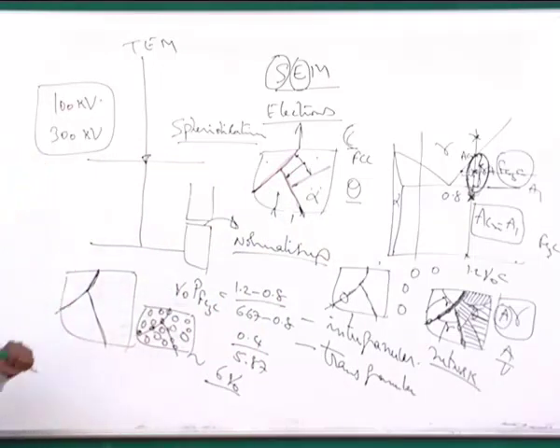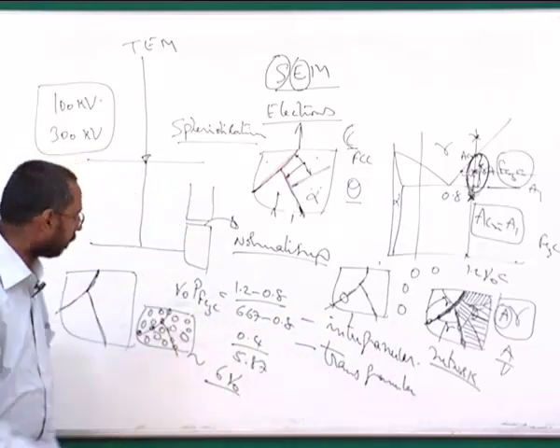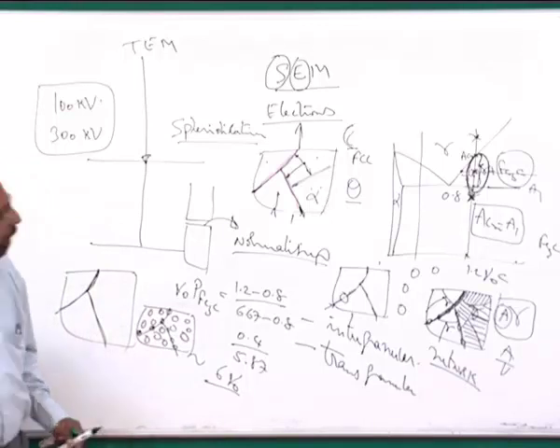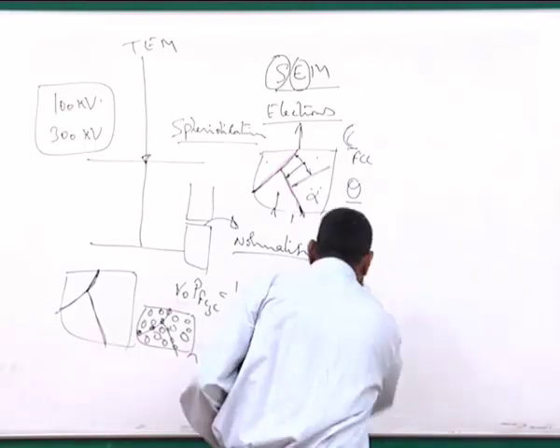This is one way one can possibly achieve higher strength and higher ductility, and in such a material, the material will not undergo any more intergranular fracture, but it will undergo a transgranular fracture, because there is no brittle network at the grain boundary. I also have possibly mentioned in the last class, we can also see such intergranular fractures in other cases.